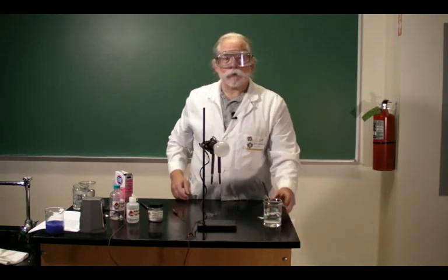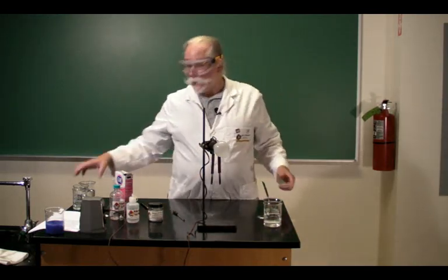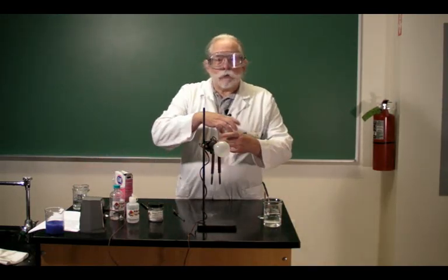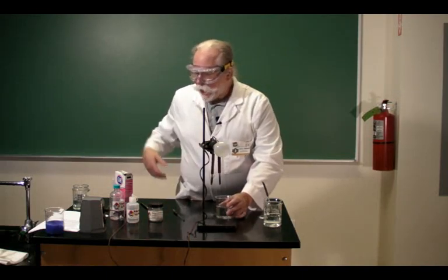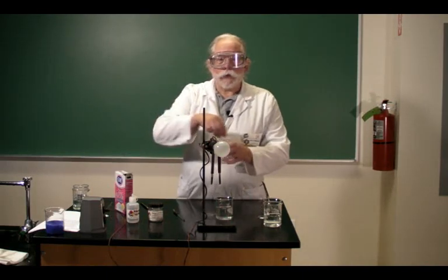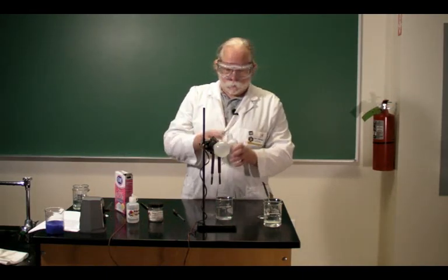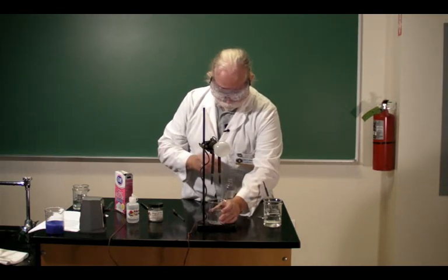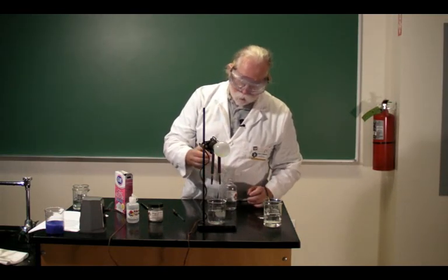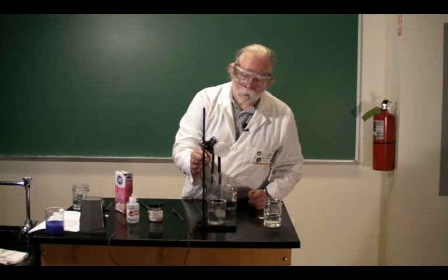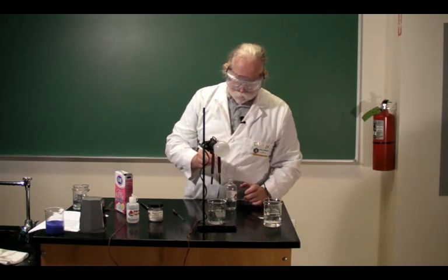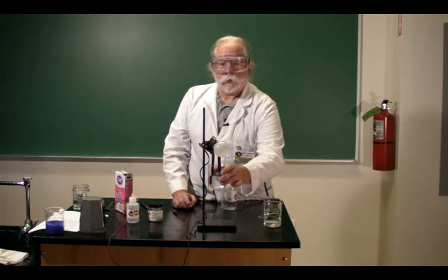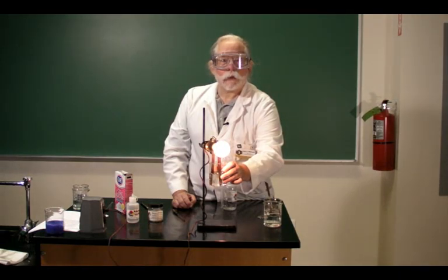Some acids and bases are also strong electrolytes. Here is an example of some hydrochloric acid. Only a little bit in the water, and about ten drops will allow the light to light up very brightly.